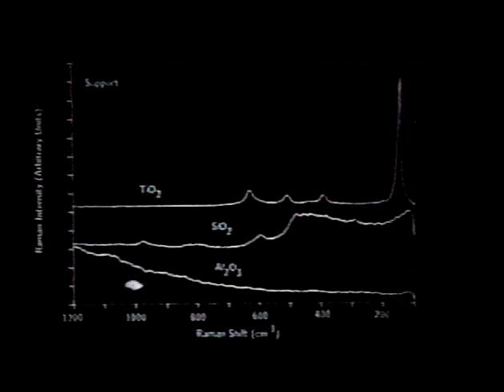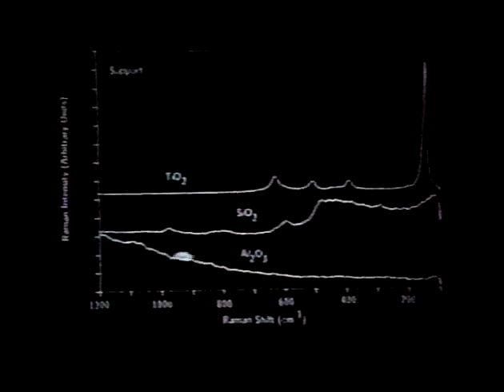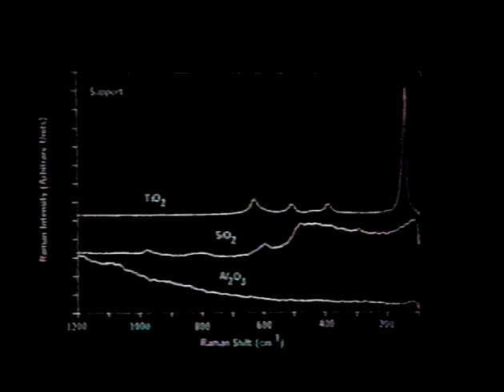In infrared, the aluminum absorbs the signal and it blows out of the window. We cannot get into this region. And as you'll see, all oxide stretches are 1,000 wave numbers or below. So Raman, in a sense, opens up this problem for us.